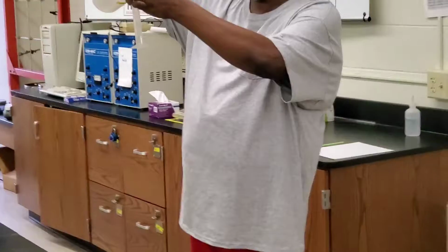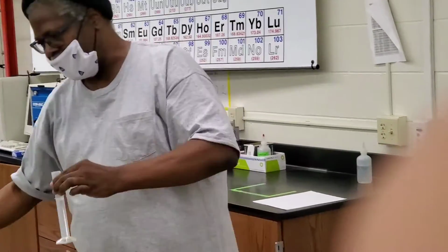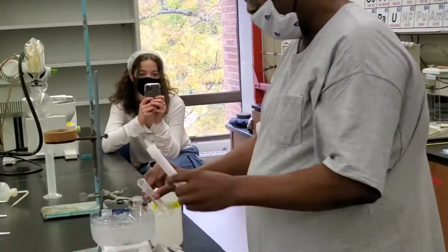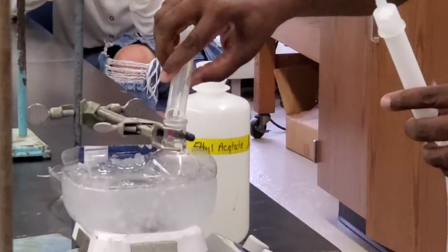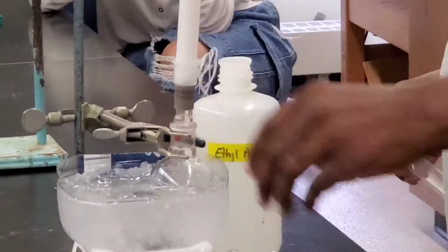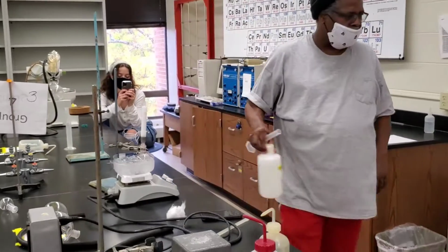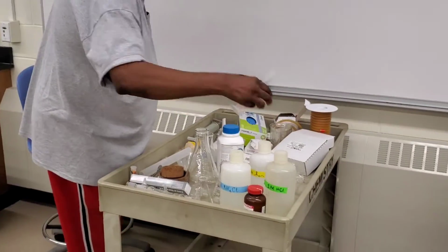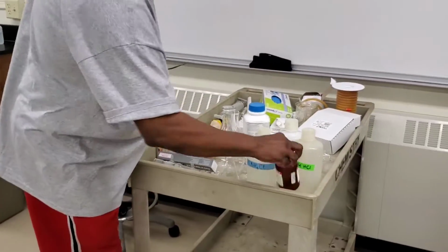So here's the solvent. And normally we add in the solvent first before we start adding the reactants. And your procedure basically tells you to do that anyway. So there's a solvent. Use this. Let's say we're doing some reaction.